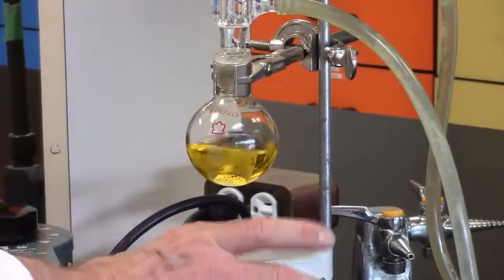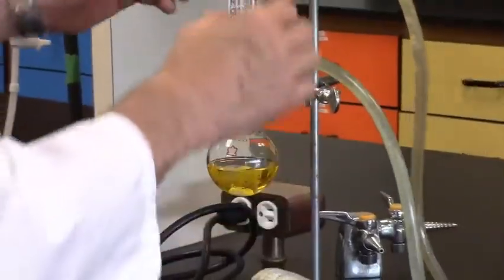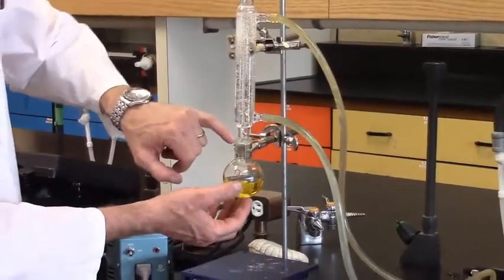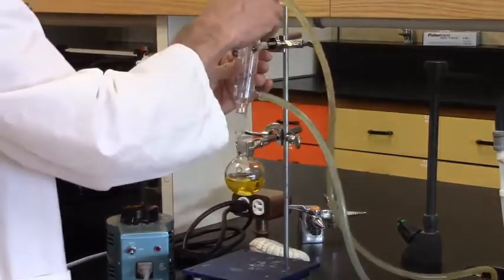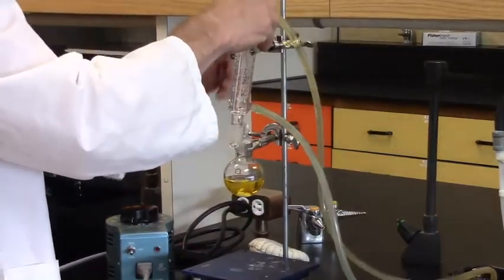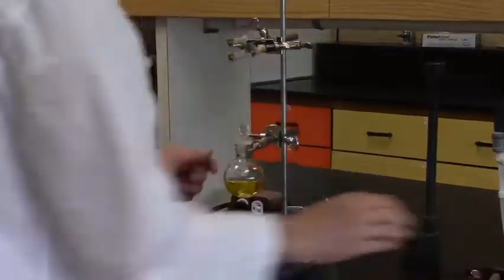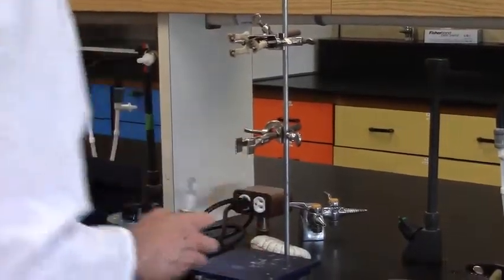I'll turn off the stirrer and start to disassemble the equipment. I'll turn off the condenser water. I can now remove the condenser. The ground glass joint is quite snug — sometimes you get a little vapor in there. All you need to do is a small twist and it comes out. I stop the flask to contain the organic solvent — trying to keep the smell down in the lab. There's my solution; I can put it in the cork ring out of harm's way.